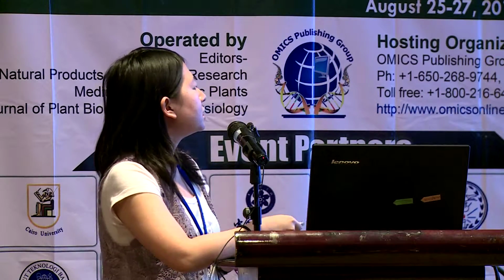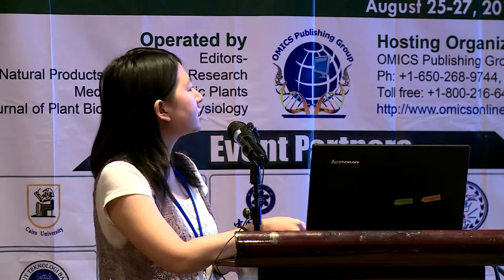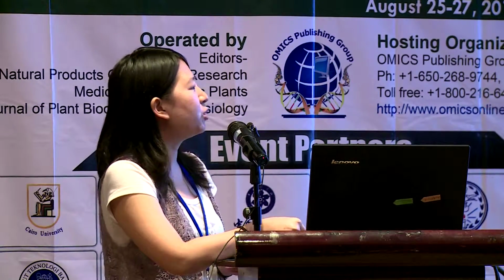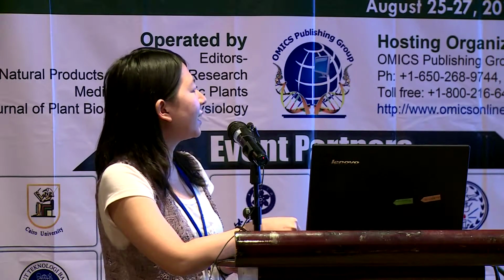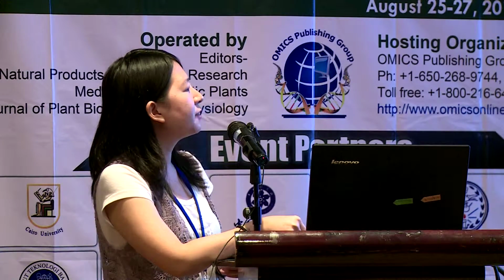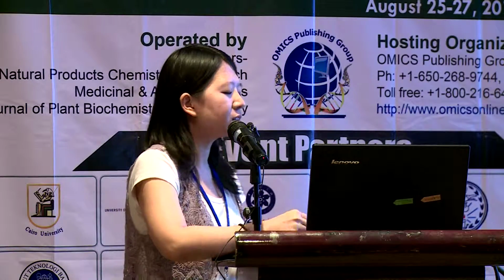And also, the GC-MS technique applied here has demonstrated to be sufficiently sensitive for detection of Amaryllidaceae alkaloids, allowing application of quantification methodology to obtain valuable information in a relatively short time. It's very fast.